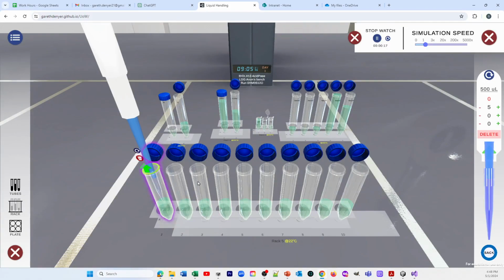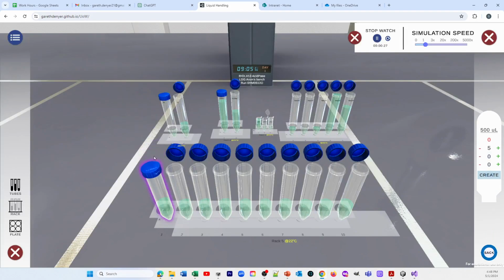Now I'm going to do this every minute. So I'm just going to take 0.5 ml every minute and put it in another tube. Now, let's actually just get rid of this pipette and close the lid and mix it. Really good idea to keep that mixing. So I've got 25 seconds. Wait until the 1 minute sample.